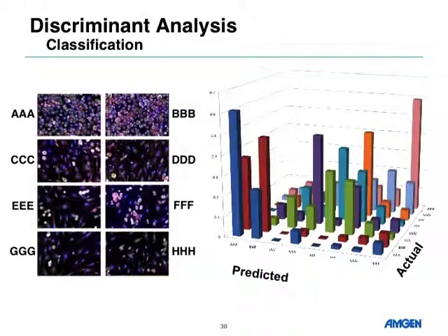But as we were doing our controls, this is using a different way of classifying. Instead of just saying, I can actually see my positives and my negatives and I'm selecting those, it uses a process called discriminant analysis. To me, this was a verification of our different types of segmenting and classification techniques.